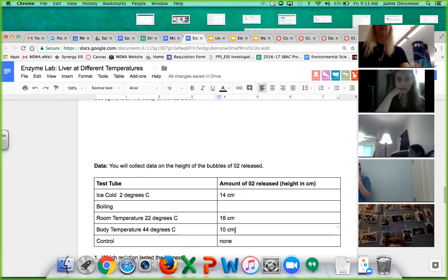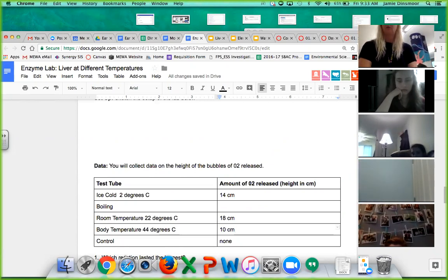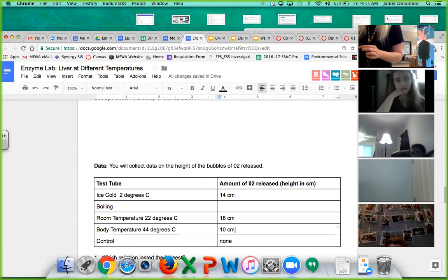Okay, our boiling liver, it's going to town over here. It is boiling. Why can't I get it in the frame? There we go. It's boiling pretty intensely. So it's going to be really hot. Try not to burn myself here. Of course, I don't have proper dish stuff in here. This might not work.